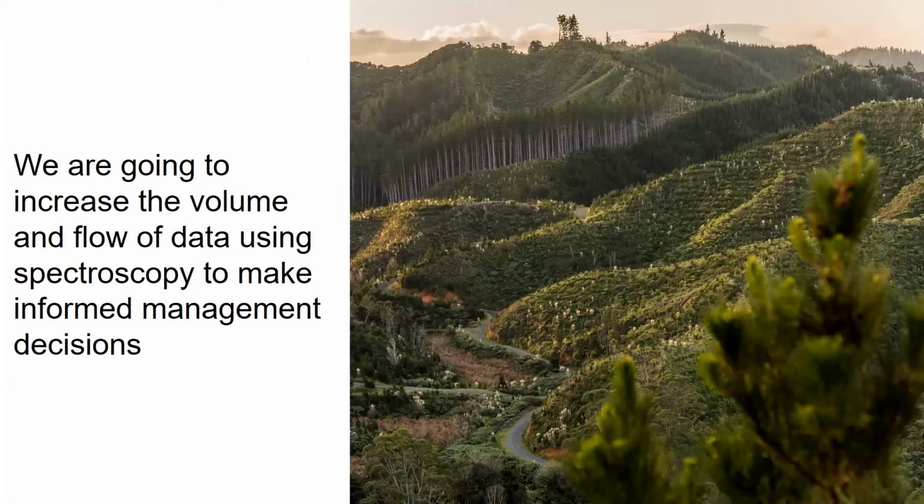Spectroscopy is all about increasing the volume and flow of data in order to make better management decisions. The technology has been around for a while and is highly used by other industries. It has been successfully applied to soil and crop foliage fertility measures, and is a way of moving away from the wet chemistry laboratory to increase our throughput of samples with accurate and precise predictions.